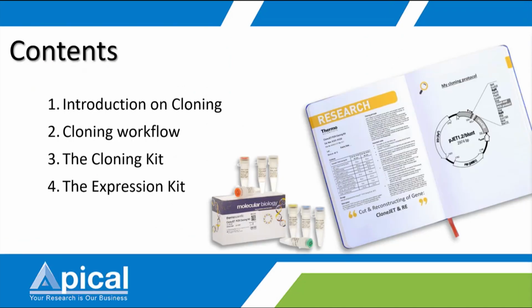In today's webinar, I will go through the introduction on cloning, then the method and the workflow for cloning. Then I will share the enzymes that are needed in the whole cloning workflow, and a little bit on the cloning kit and the expression kit and how they can help you in your study.